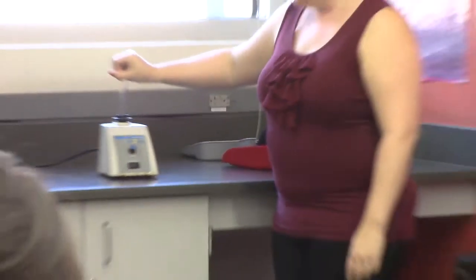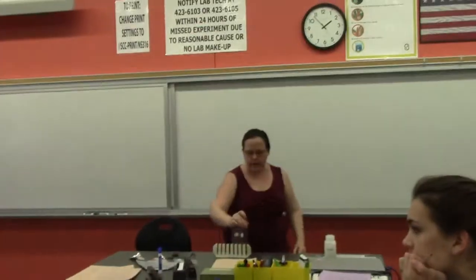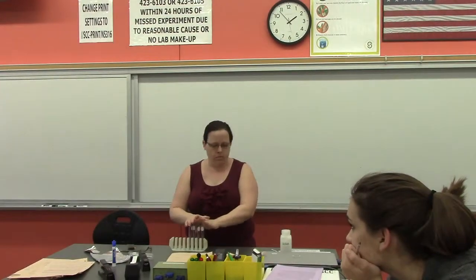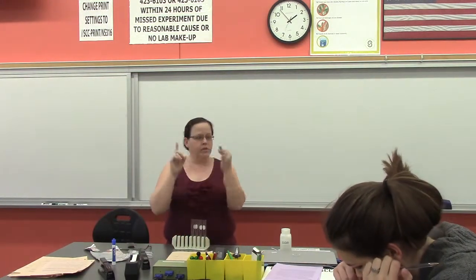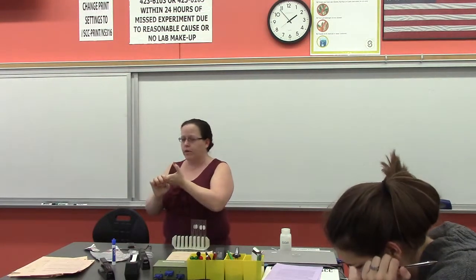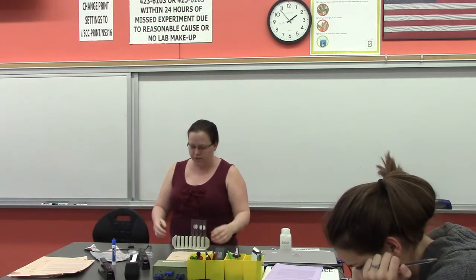Okay? Just put it on the vortex mixer, make sure it's mixed nice and thoroughly, bring it back, then you can observe it. Either method you can use for stirring, but stir them up, then observe them. Okay? It says, what are your observations? Did everything dissolve? Was there a color change? Did nothing dissolve? Is there still some solid left over, but it's less solid than you put in, so some of it dissolved, right? Those are your observations.